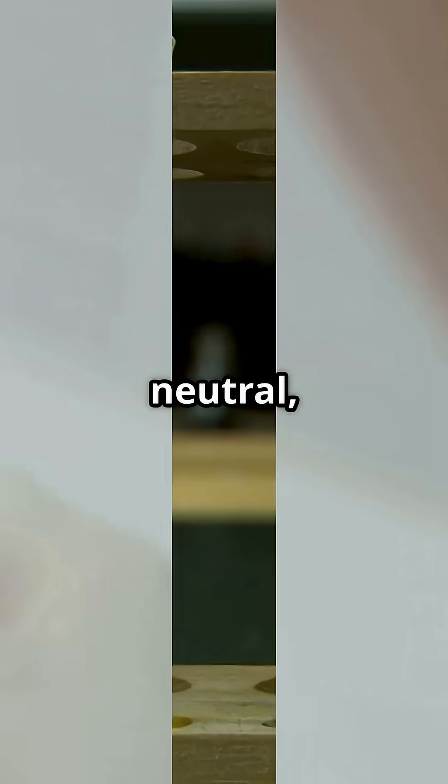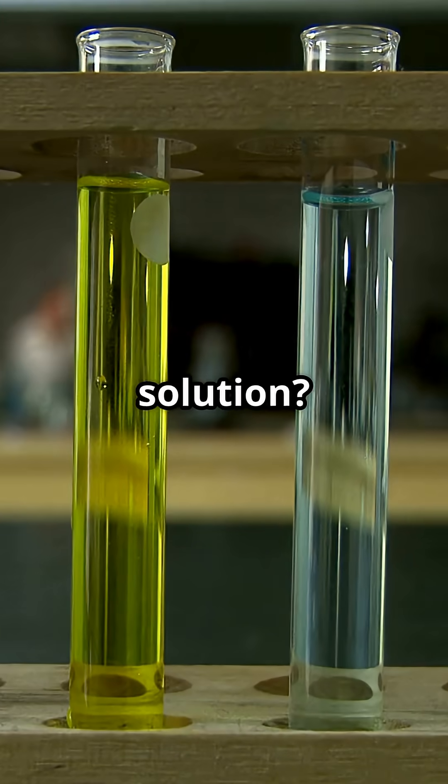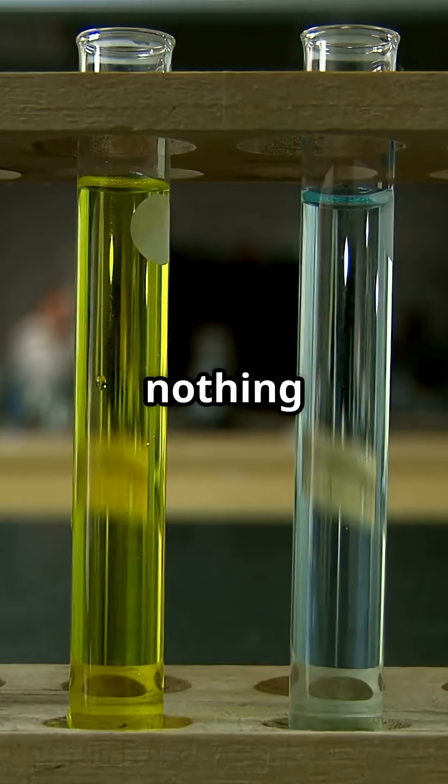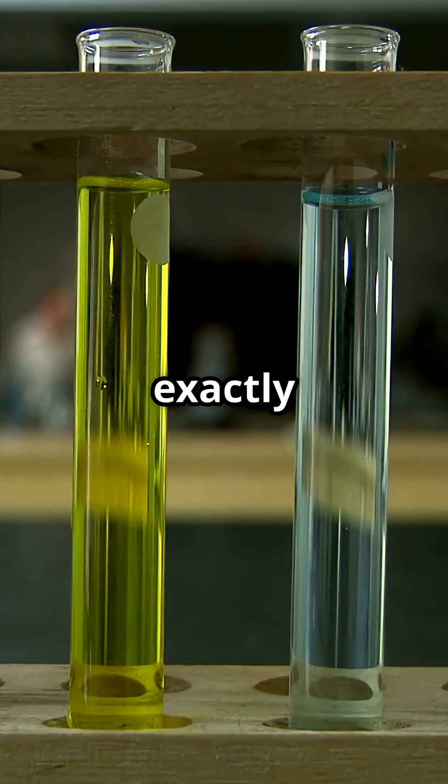Now, what if you test something neutral like tap water or sugar solution? Absolutely nothing happens. Litmus paper stays exactly the same. No colour change, no drama.